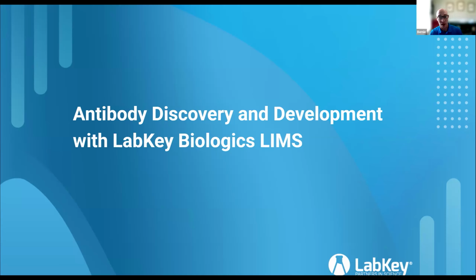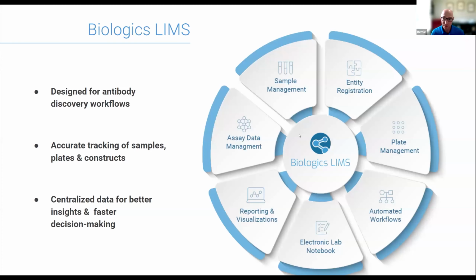My name is Bernie Lee. I'm a product manager here at LabKey, and I have a short presentation for you. We'll be briefly talking about some of the data management challenges in biologics discovery and development, and some of the tools and strategies we employ here to drive success, improve efficiency, and increase quality of life for scientists, and ultimately what that facilitates. I want to spend most of today in the product itself through the lens of our Biologics LIMS.